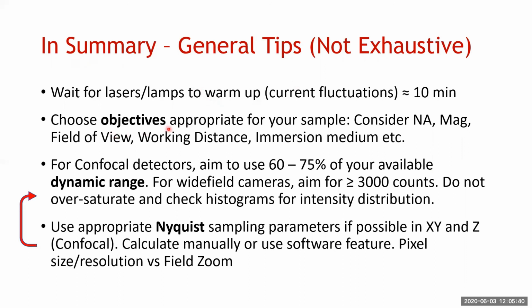Objectives. We want to make sure that you know what objectives you're using and why you're using that objective. So consider everything: numerical aperture, magnification, field of view, working distance, immersion media. Once you figure that out and you know what you're doing, then you really don't have to think about that.